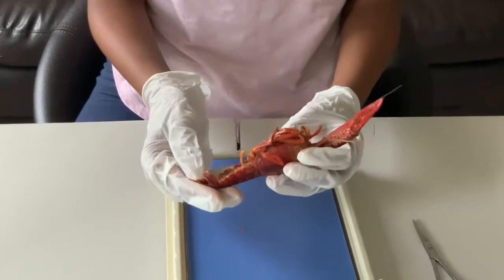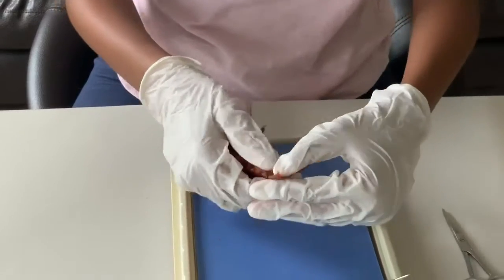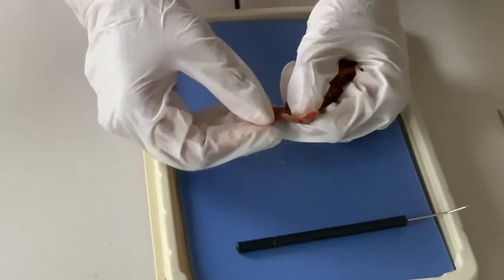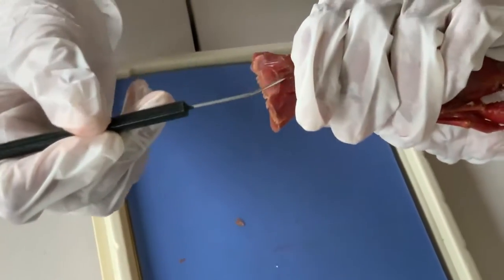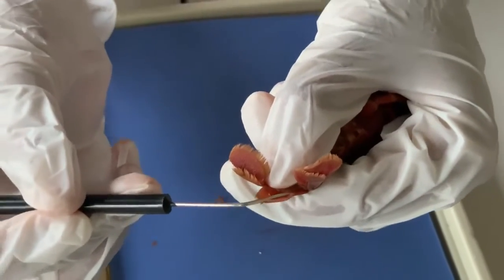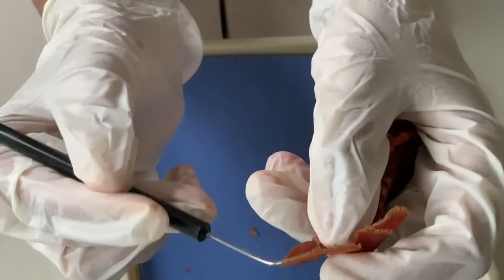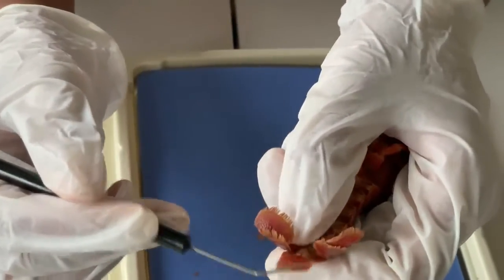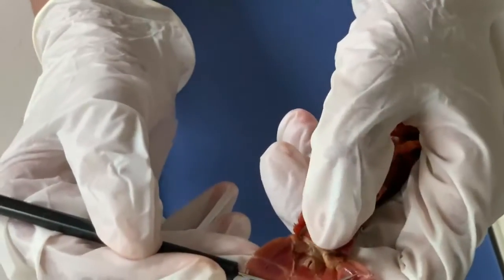Why don't we take a closer look at the tail of the crayfish. The middle part of the tail is called the telson. The ones on the side are called the uropods. And you can even get a better look at the anus.